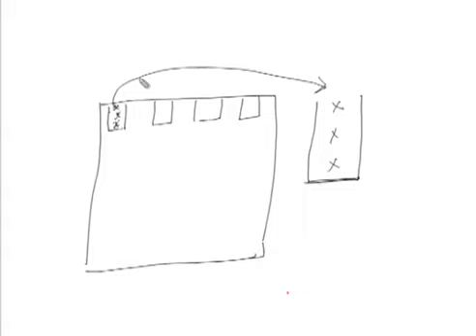Now, obviously, when you have dilute solutions, this is the amount of sample you have taken and it is a large volume. Since your analyte or molecule is distributed all over, the molecule closest to the gel interface will enter first and will also move somewhat on application of the electric field. But the next molecule of the same analyte will enter with a time gap relative to this one. If I say number 1 and this number 2, then number 1 will move somewhere, and then number 2 will enter in.